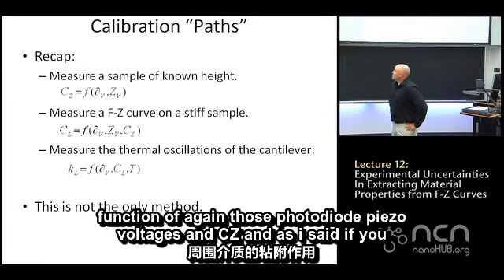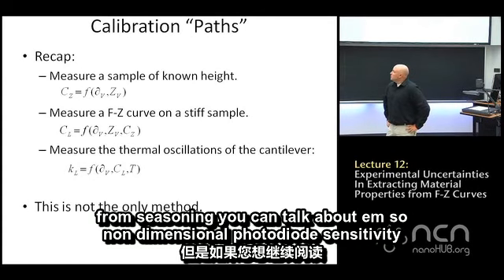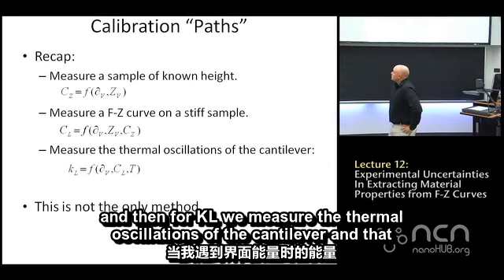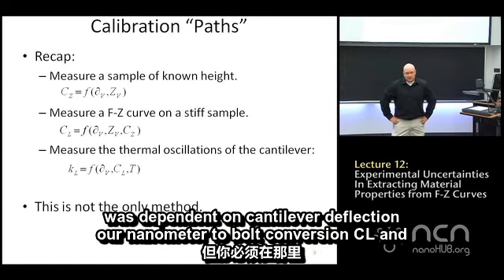And if you want to remove that dependence from CZ, you can talk about M, the non-dimensional photodiode sensitivity. And then for KL, we measured the thermal oscillations of the cantilever, and that was dependent on cantilever deflection, our nanometer to volt conversion, CL, and T.